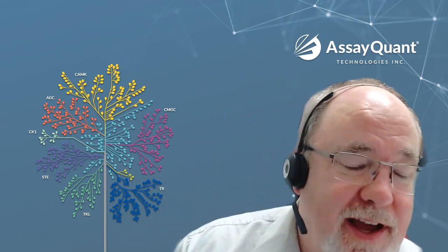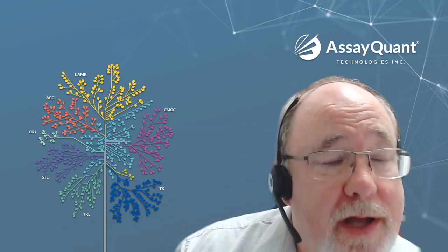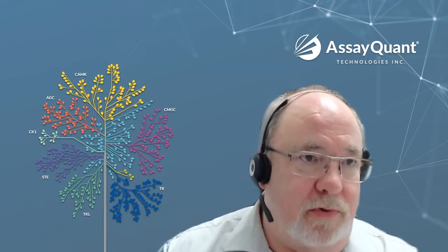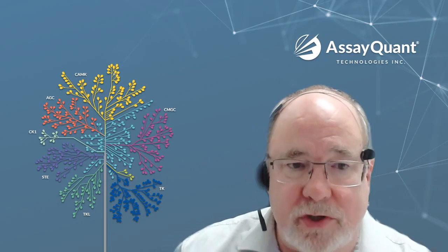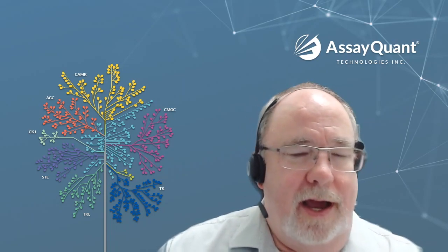We definitely will do a dose response test in our assay format with our enzyme construct, with our peptide substrates, before we recommend a concentration for kinome profiling. You can go right in blind and just cross your fingers, but we tend to generate an IC50 first and then do our kinome profiling at a concentration about 10 times over that IC50. And so that's what we recommend to folks.